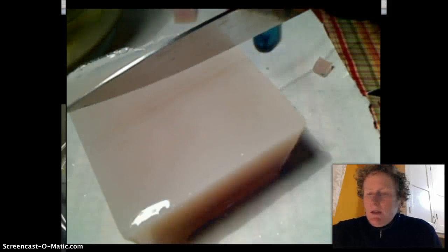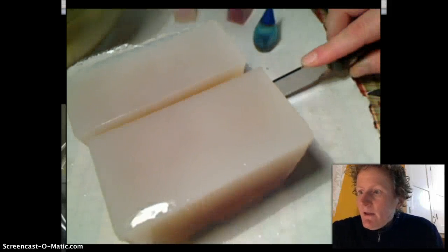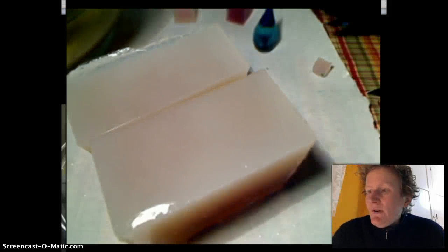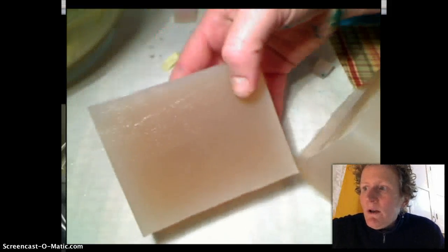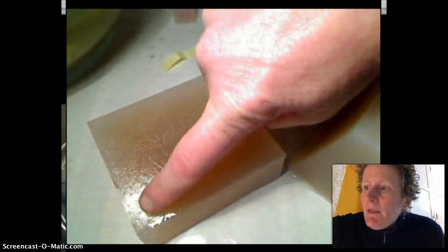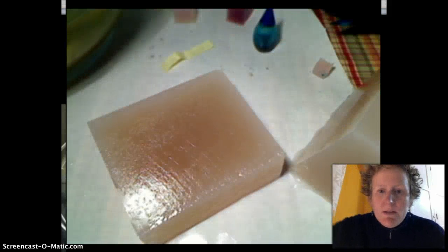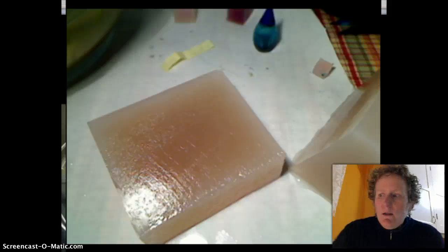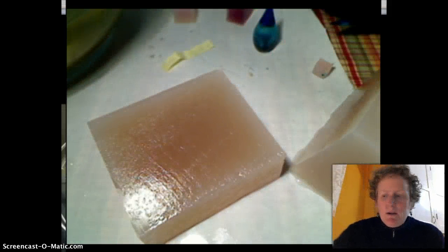If I take a knife and cut this really big model cell in half, we'll look at how far the vinegar diffused over a long time. The vinegar barely got into this large cell at all. And this is why cells aren't really big.